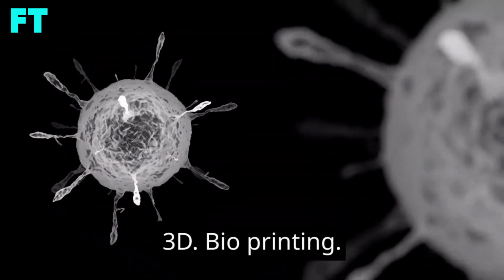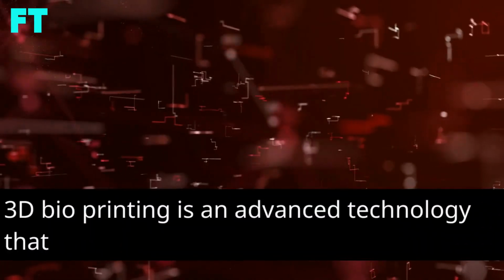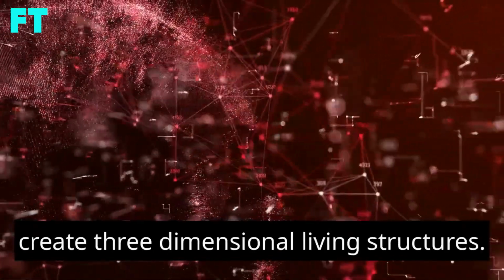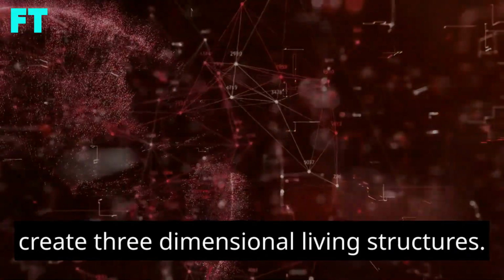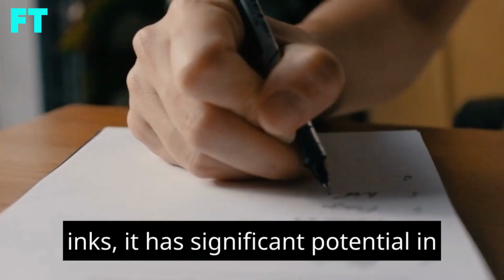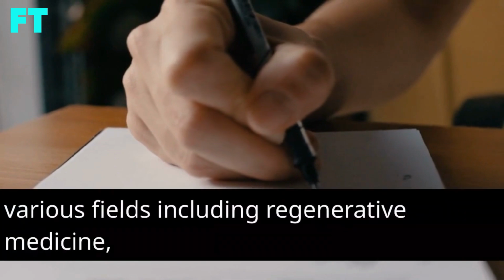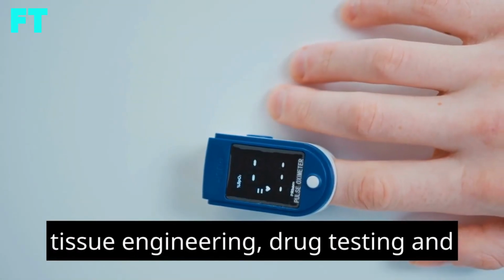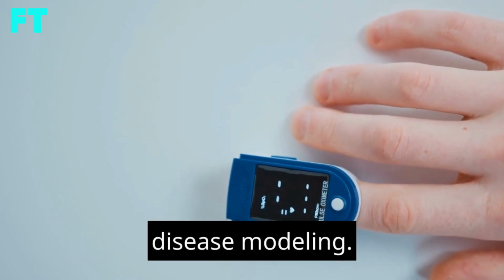3D bioprinting. 3D bioprinting is an advanced technology that combines 3D printing with biology to create three-dimensional living structures, often using human cells or other biomaterials as bioinks. It has significant potential in various fields, including regenerative medicine, tissue engineering, drug testing, and disease modeling.